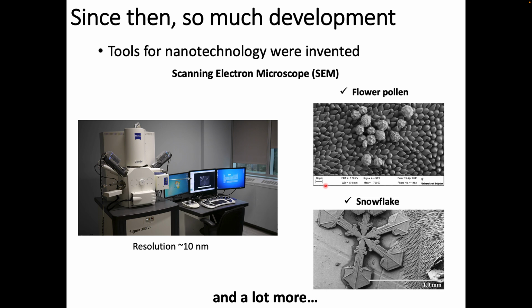So you can only get gray images, just white and black. That is why you only get black and white images. But if you search the literature, you can find some color SEM images. Those are essentially post-processing. You are color coding certain features, and that is not really raw data.